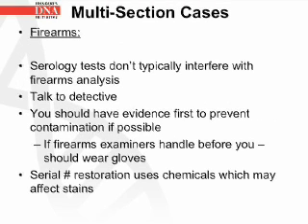With firearms, serology tests don't typically interfere with the firearms analysis. Once again, talk to the detective. You should have evidence first to prevent contamination if possible. If firearms examiners handle before you, they should wear gloves. Serial number restoration uses chemicals which may affect stains.